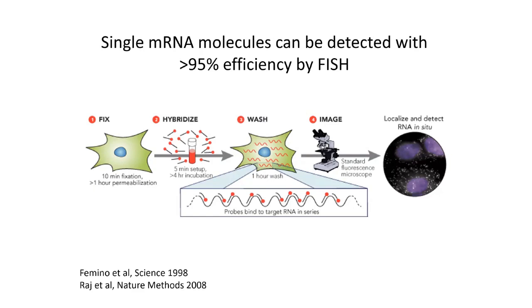Okay, so all of this method is based on single molecule FISH, which of course was pioneered by Arjun and Rob Singer. And this is a method that allows you to detect individual transcripts or DNA loci, with a set of probes, and they're labeled, and you can hybridize them in the cells, which then when you image on the microscope will give you these puncta.